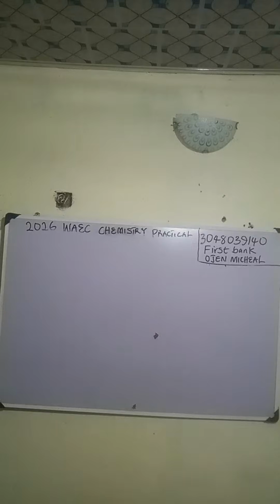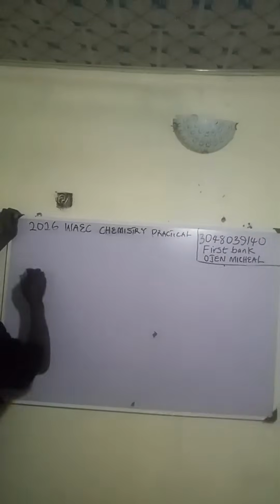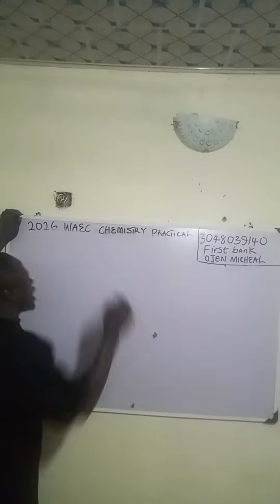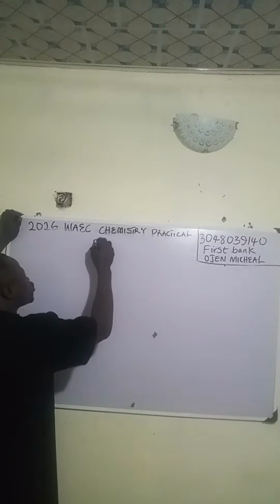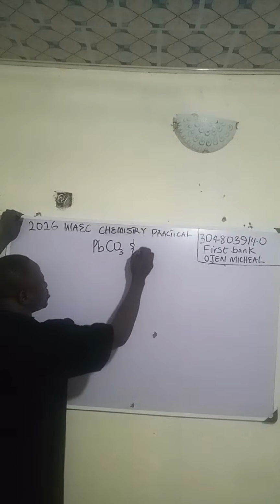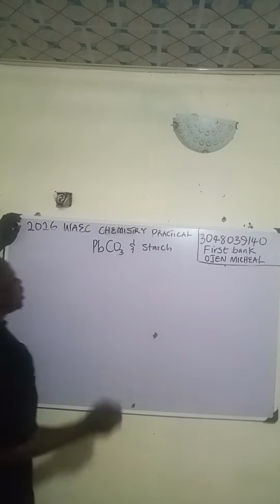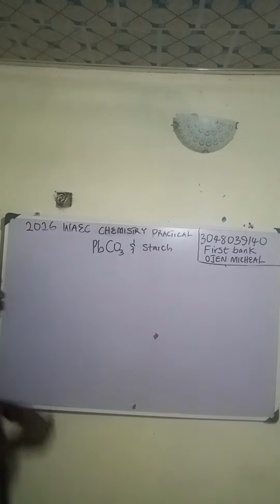Now, in salt analysis, what you should know is that you are always given the salt we are asked to analyze, which is what? Lead carbonate and starch.